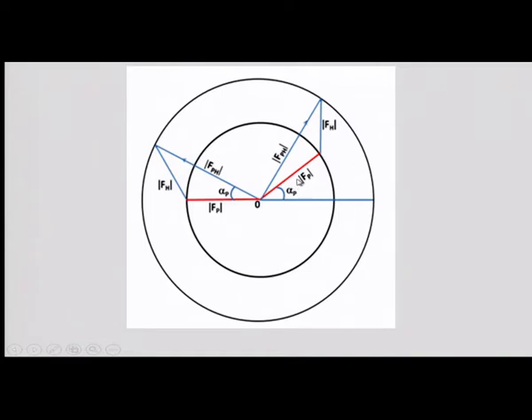When you take the first derivative, mod F_P can be this way or this way. When mod F_H is added, here we get mod F_PH. Now we have two circles: one drawn with center O and radius mod F_P, another drawn with center O and radius mod F_PH, but this can go this way or this way. So the twofold ambiguity is there.